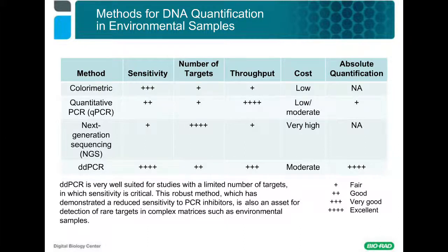This affords a great sensitivity to this method, but the number of targets is very limited, as is the throughput. The cost is relatively low, at least in terms of reagents, but not in terms of time and manpower, and of course, it does not provide an absolute quantification.